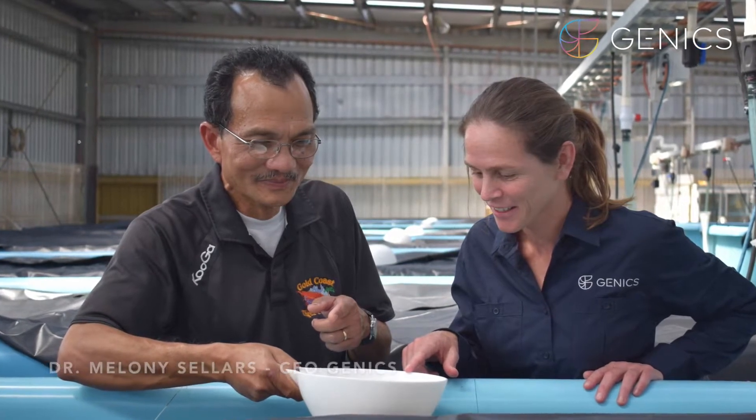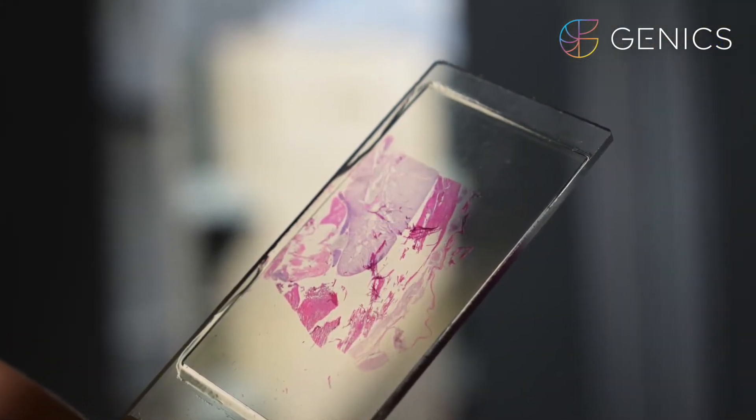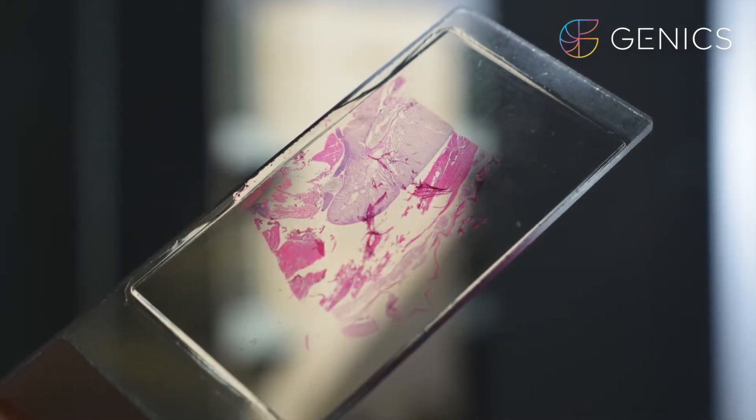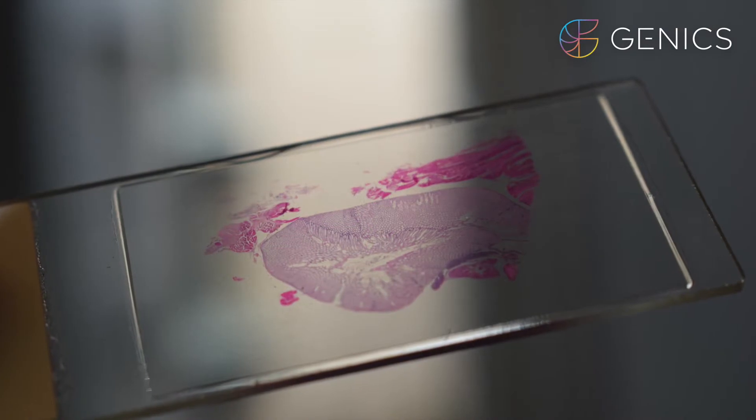Hi, I'm Dr. Melony Sellars, CEO of Genics. Today we are going to sample our black tiger shrimp for both shrimp multipath testing and deep-dive histopathology. We need to work fairly quickly in order to get the tissues and organs preserved as fast as possible for these two different investigation purposes.